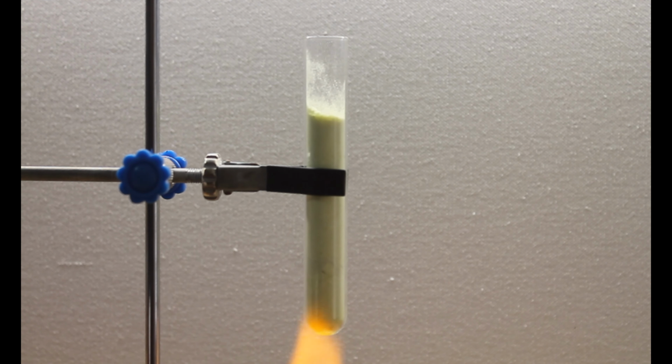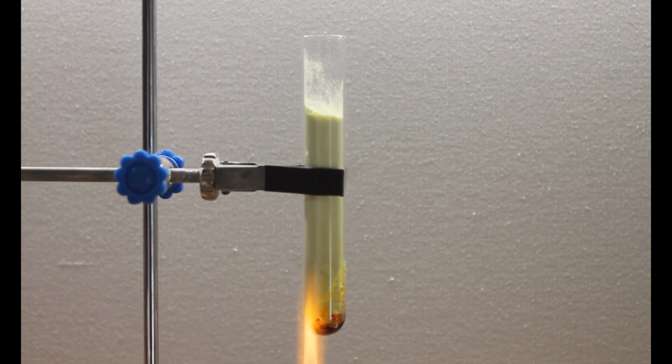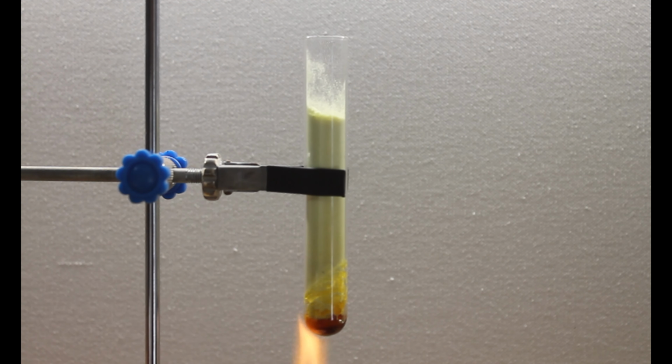Sulphur has a relatively low melting point of only about 115 degrees Celsius. Plenty low enough for us to melt it over a small spirit burner. The reason we want to do this over a small flame is to limit the production of potentially harmful gases, such as sulphur dioxide.